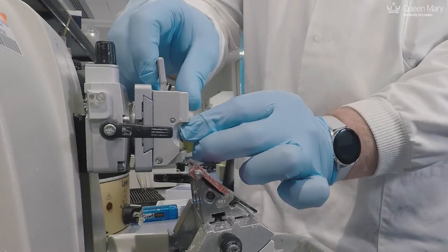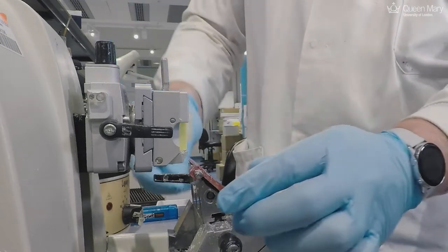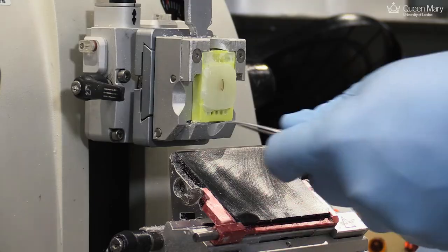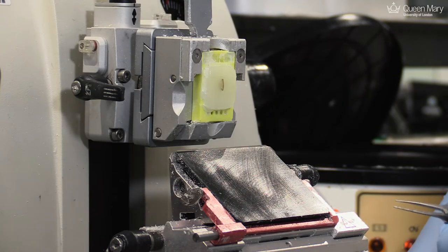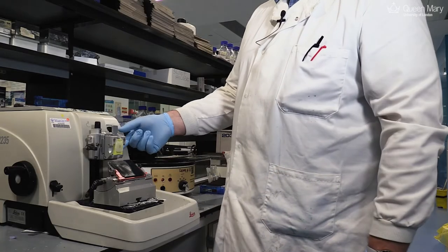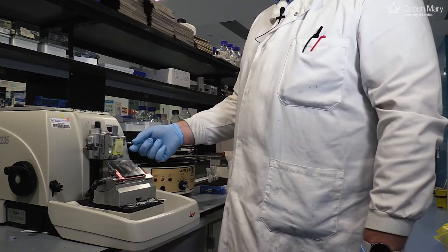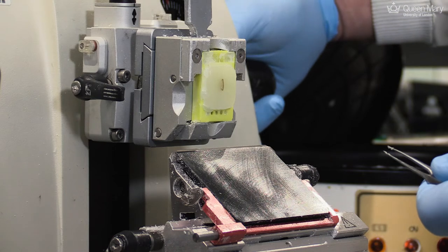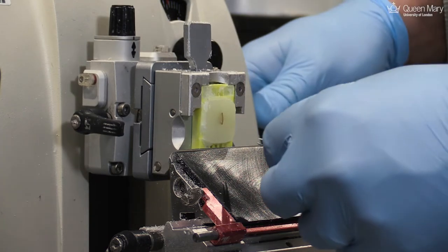We'll mount the block in the microtome, which holds it in place, and we have an extremely sharp microtome blade that we use to cut the sections. We can set how thick we want the sections—I've set this to be 5 microns—and then we can cut very thin slices of the wax block, which will give me very thin slices of the skin.